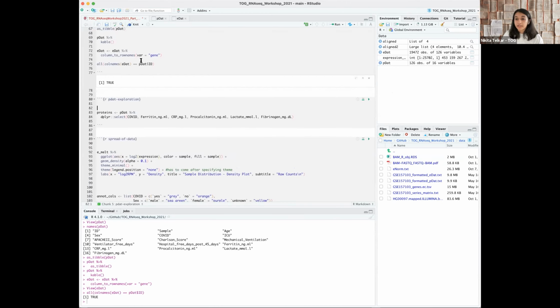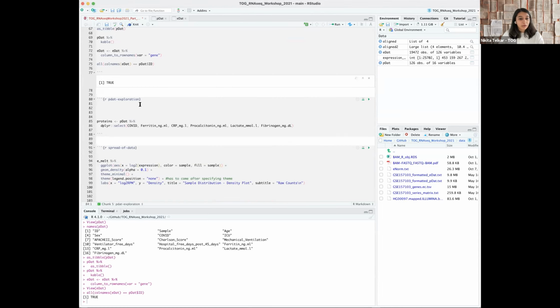Okay, any questions so far? Feel free to speak up. Okay, that seems great. So now we already have this little bit over here. Just let's leave that and we'll start over here.